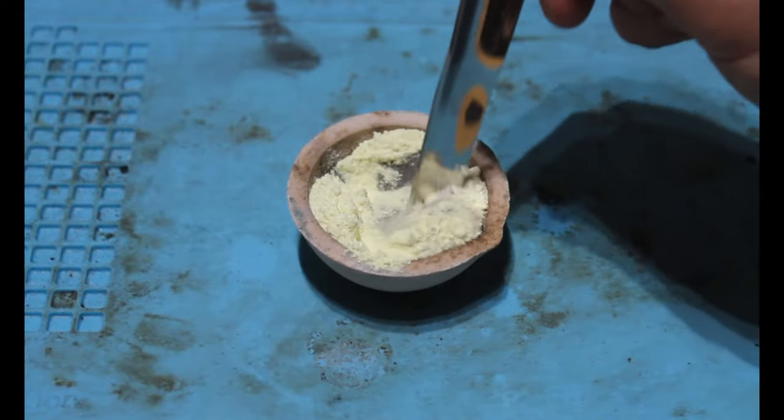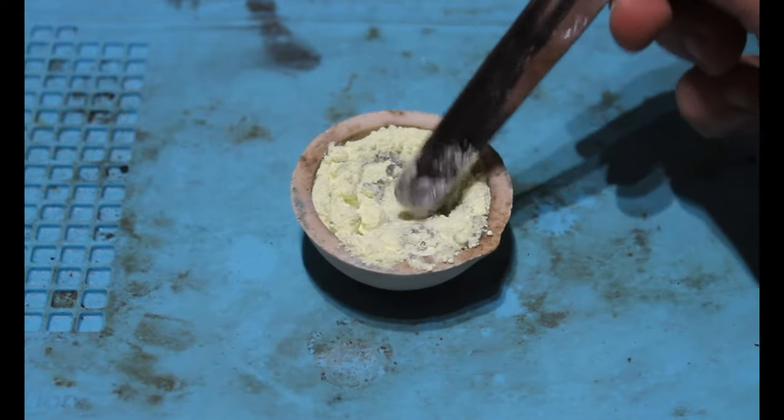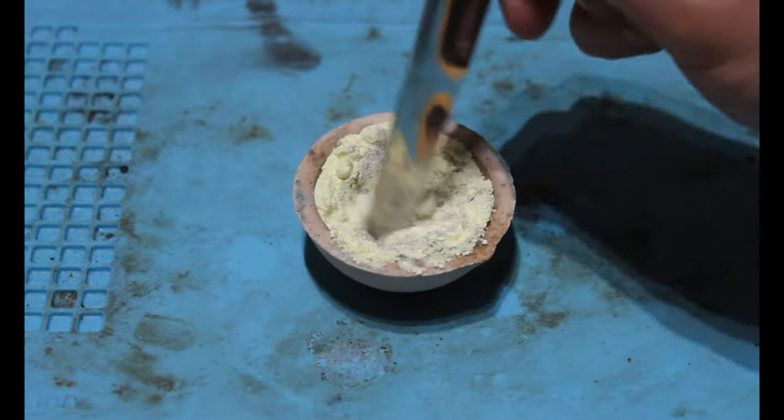Both materials are placed in the crucible and given a stir to ensure good contact between our two elements.